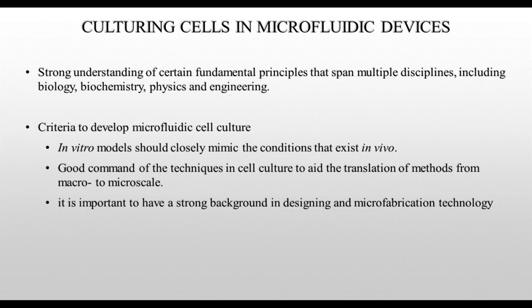So how do we culture cells in microfluidic systems? Culturing cells in microfluidic devices requires a strong understanding of certain fundamental principles spanning disciplines such as physics, chemistry, biology, and engineering. So it's an interdisciplinary kind of study, and there are certain criteria which need to be followed. Firstly, the developed system should closely mimic conditions that exist in vivo, and the person handling it should have a good command of cell culture techniques to translate methods from macro to micro scale. And this is usually the most challenging part. Also, another criterion is that the person should have a strong background in design and microfabrication techniques.